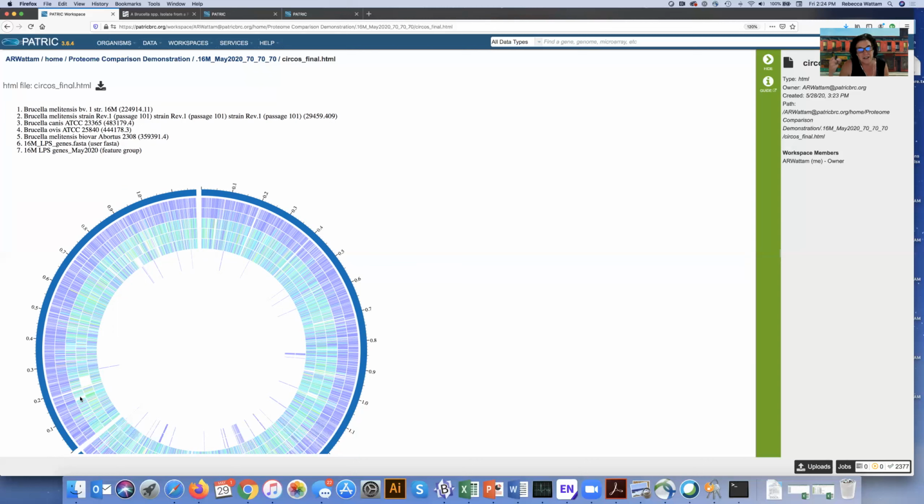It also indicates that when you publish it, you need to describe exactly what you did. And you also need to verify things, so you need to go looking to see if those things were actually missing. Next is the ovis genome, which also has a big blank.